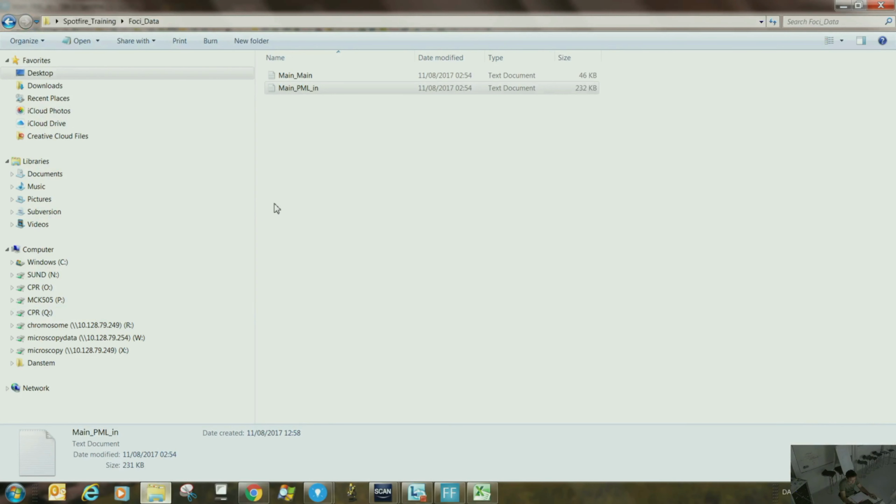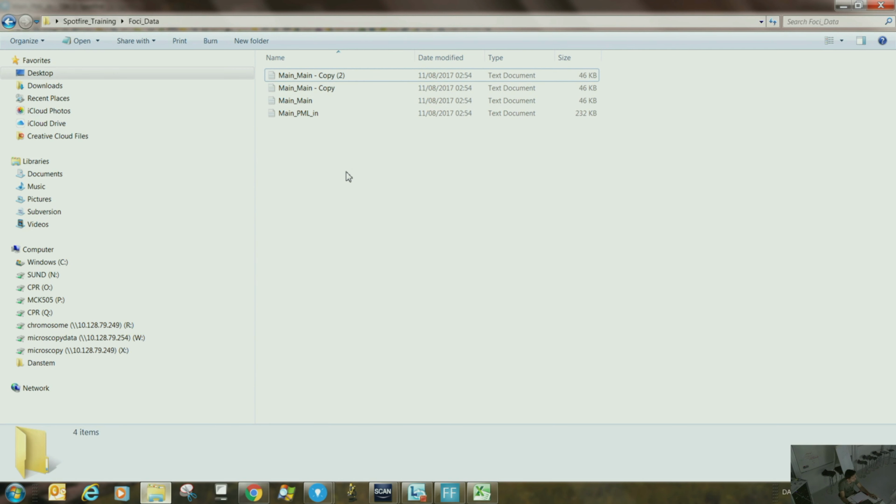Now imagine that you have done this experiment and you have repeated this experiment. Let's say you have 3 replicates, and now we're not going to have 3 replicates, but imagine there are 3 such files. So 2 query genes and 1 is your control. These 3 replicates. Now the question is, how do you take all these into one Spotfire and show them as replicate 1, 2, 3, right?